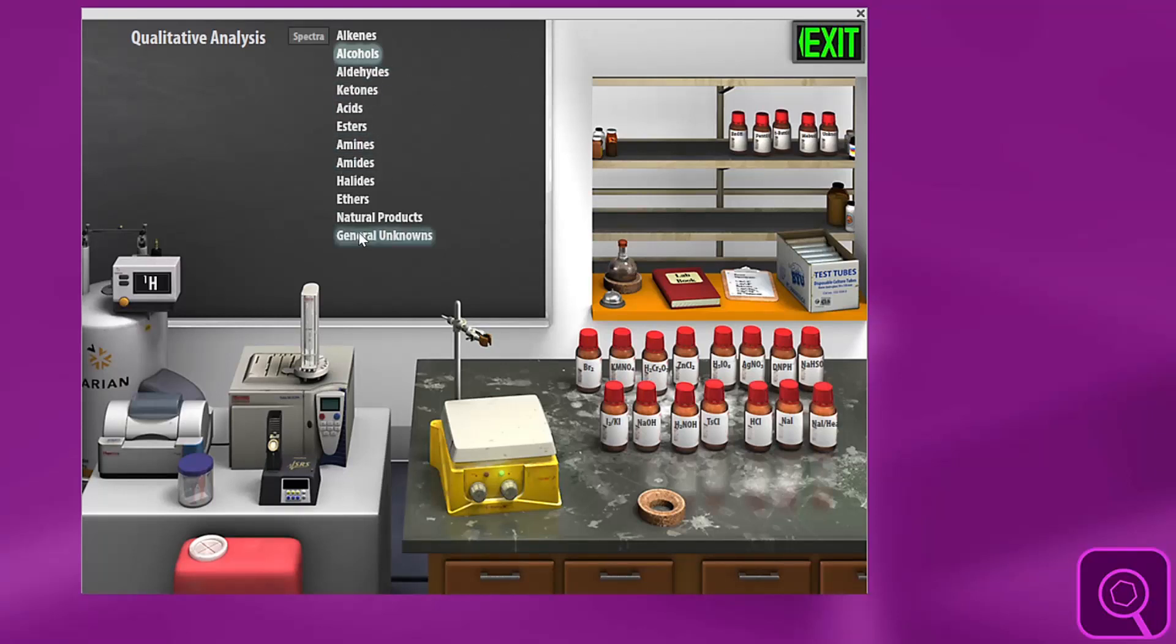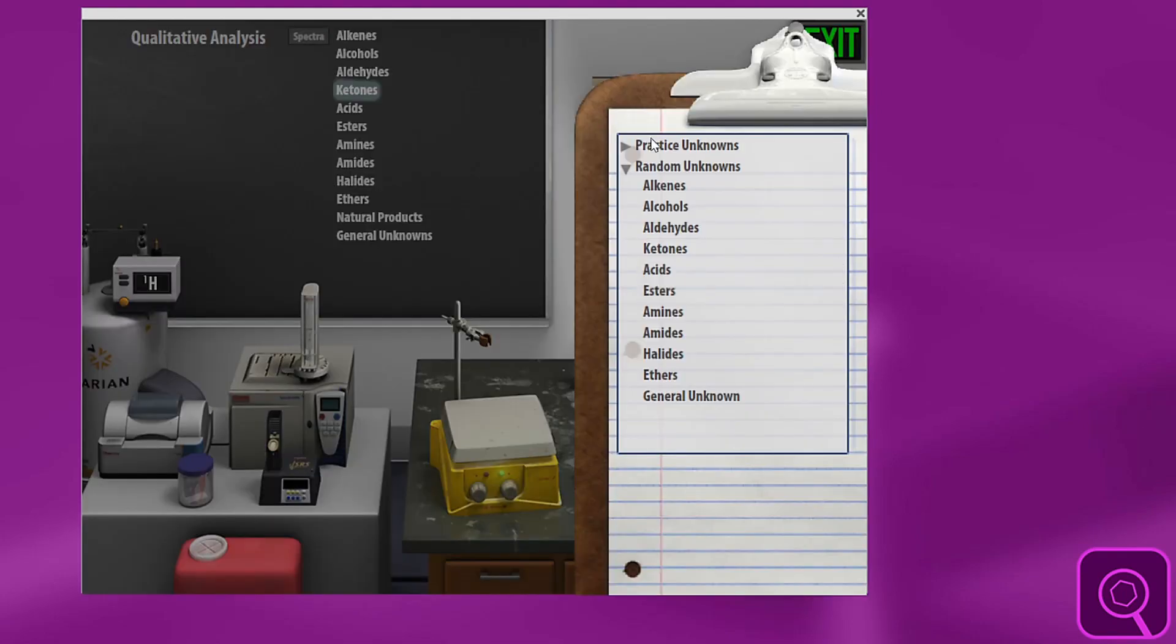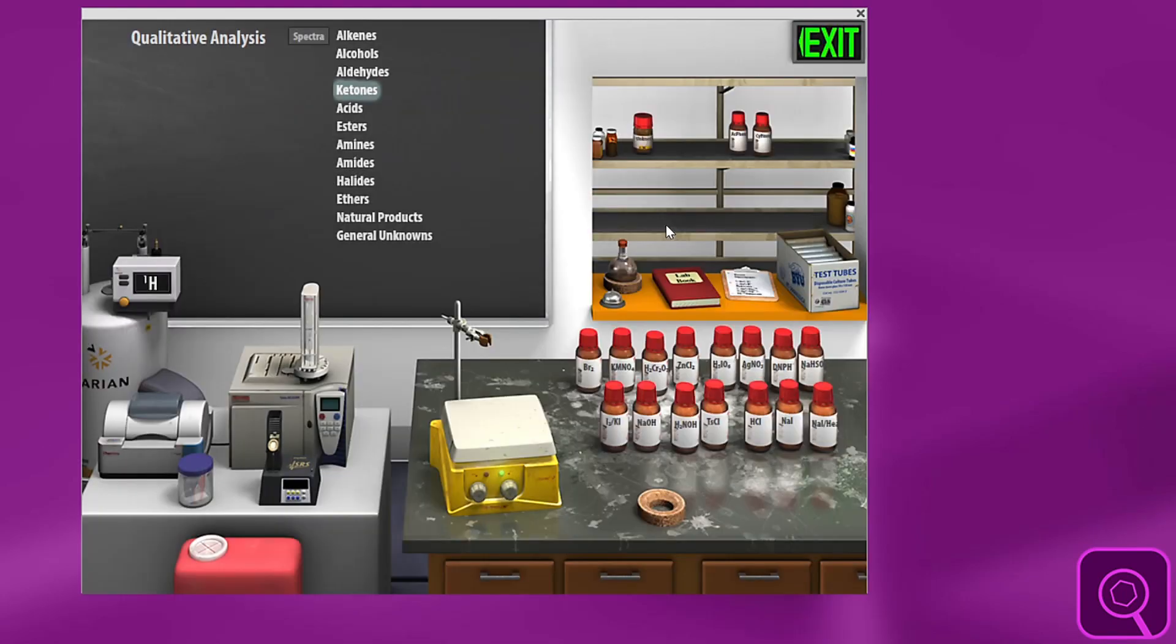When you use the blackboard itself, all of these functional groups have an unknown on the shelf. This unknown matches the exact same unknown that would be given to the students if they were to pull up the practice unknowns ketones. It's the exact same unknown, so that's the same way to access those numbered unknowns. Hope this helps.